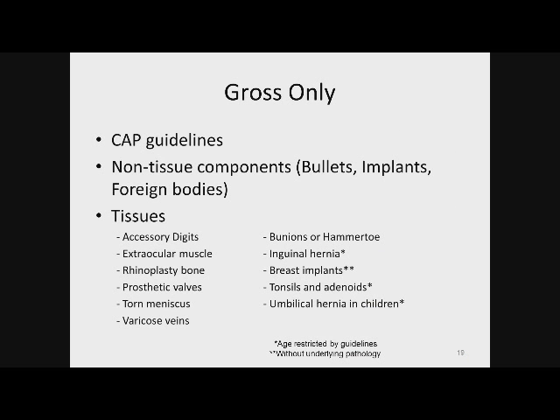And when grossing specimens, there are a couple of additional considerations, and those are specimens that are gross only and specimens that are excluded from grossing. Now, both of these classifications of grossing specimens can be grossed in, and some hospital laboratories will gross them in and have the histotechnologist process them, cut them, stain them, and have them read microscopically by a pathologist.